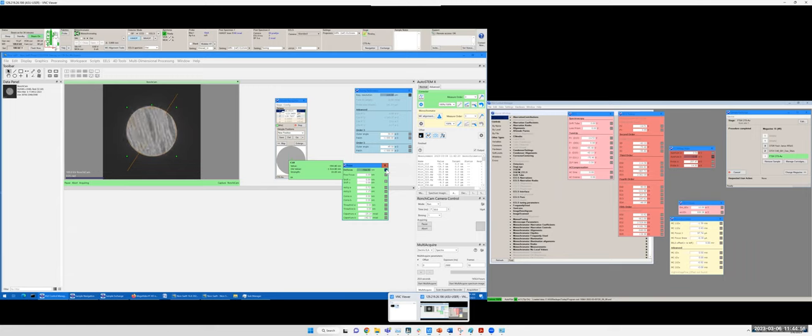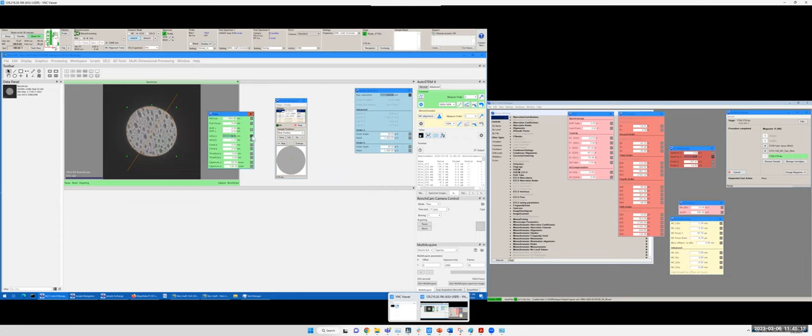Okay, you can see the aberration is very bad, right? We roughly see the crossover where the distortion goes to a perpendicular direction. We define that as zero. We go to a larger 900 nanometer. Actually, you can hand tune because those gold particles should be round, right? So they're not round. You can easily just roughly tune those to make them round. It will make the system converge faster.